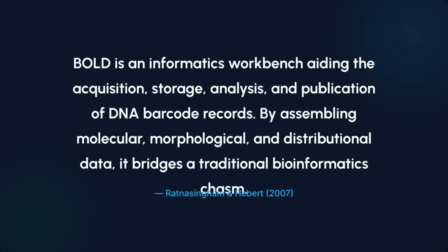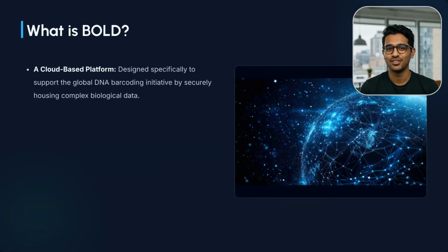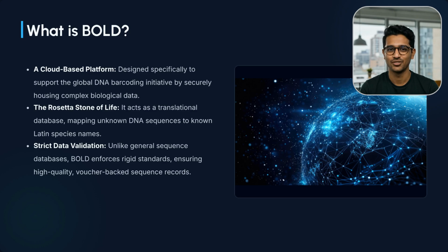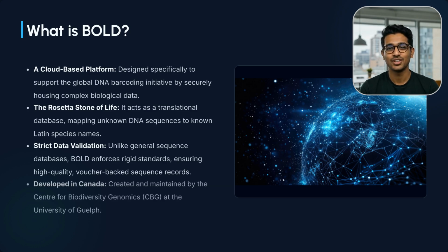BOLD serves as an informatics workbench supporting the acquisition, storage, analysis, and publication of DNA barcode records. It bridges traditional bioinformatics by assembling molecular, morphological, and distributional data. BOLD is a cloud-based platform for DNA barcoding. It acts as a Rosetta Stone, mapping unknown DNA sequences to Latin species names, and enforces strict data validation. It was created and maintained by the Center for Biodiversity Genomics in Canada.